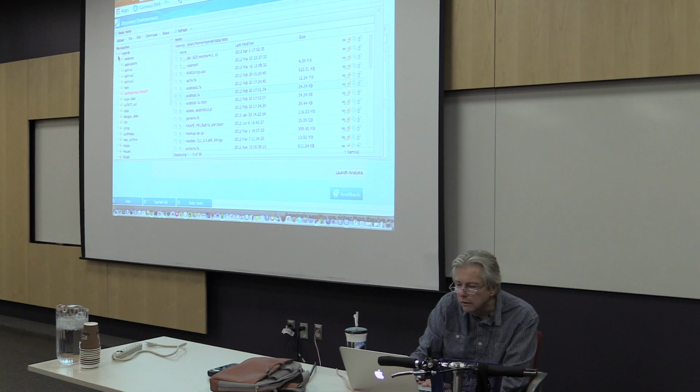In any case, let's get out of my area and back to the community data, iPlant training, and all the way down here, intro RNA-seq.